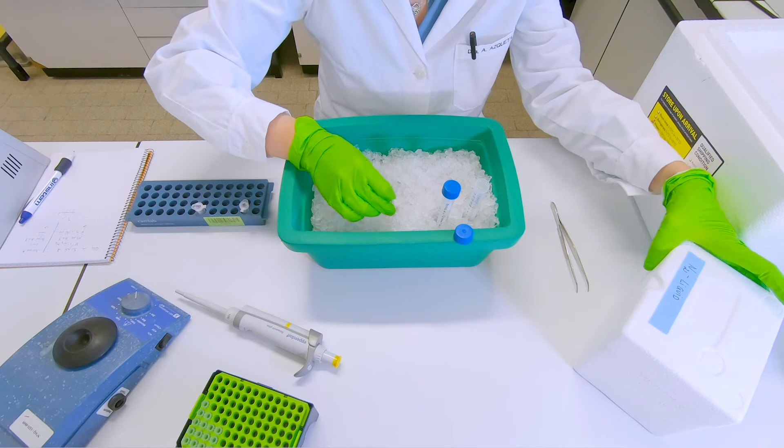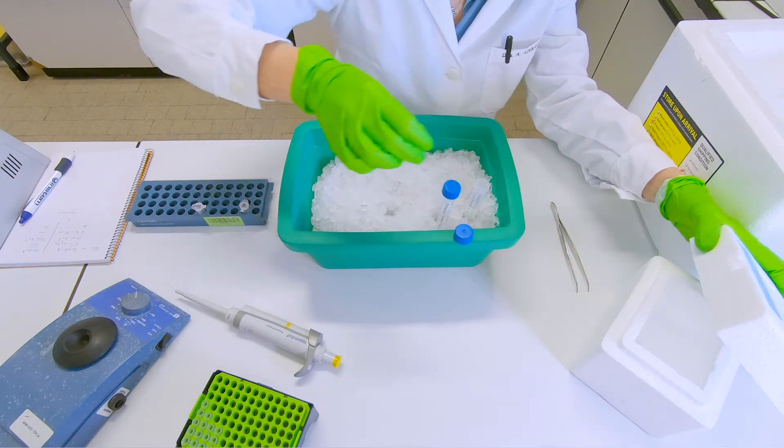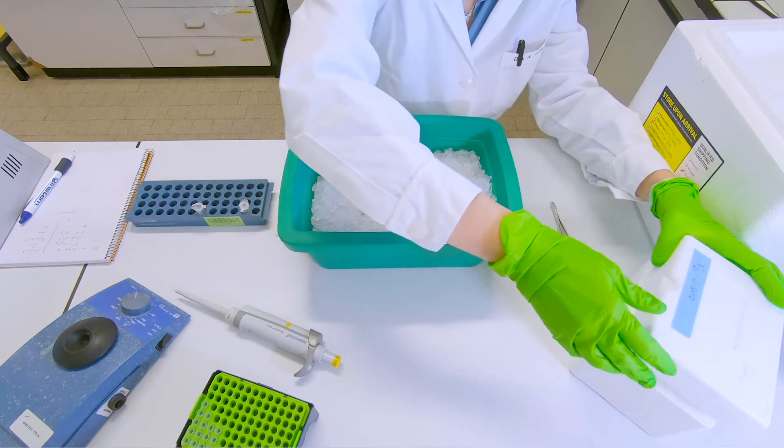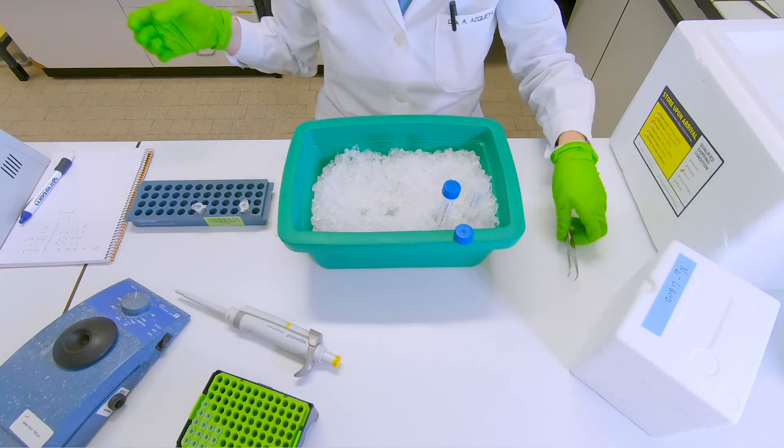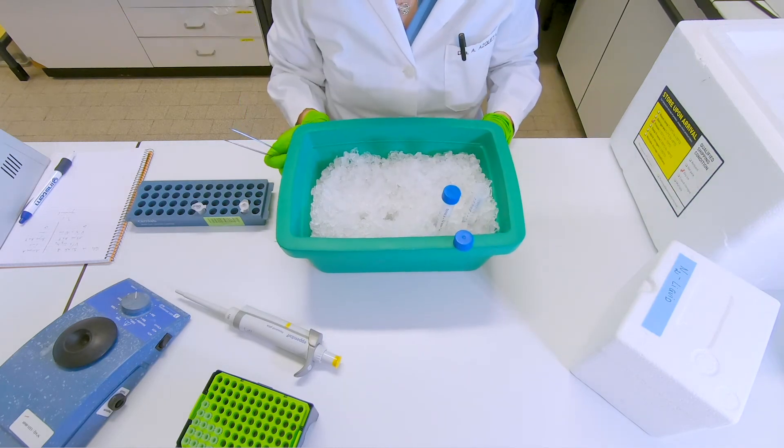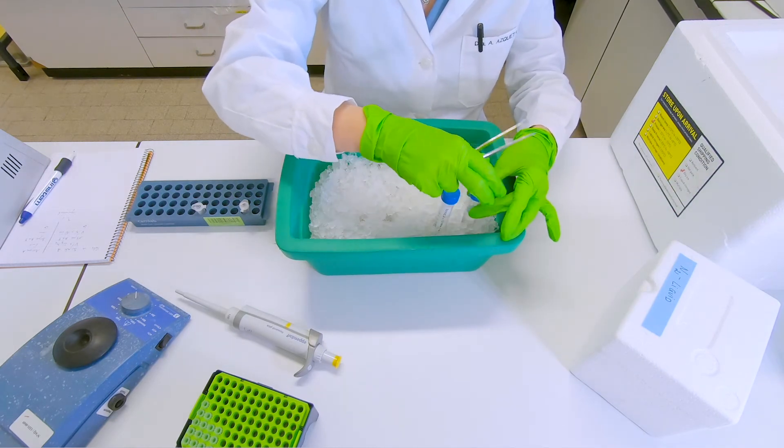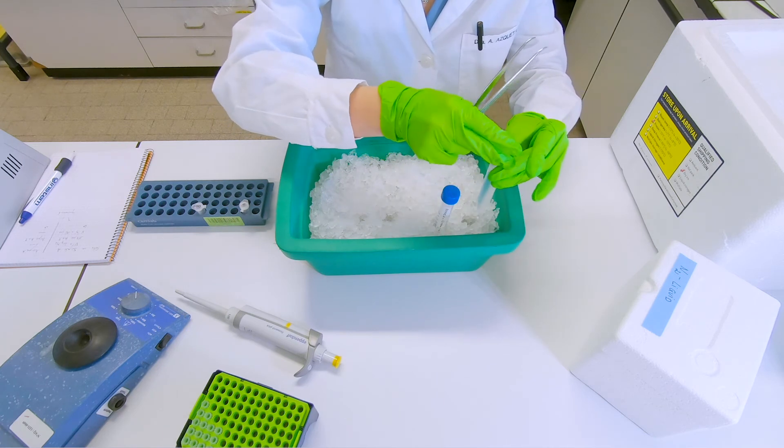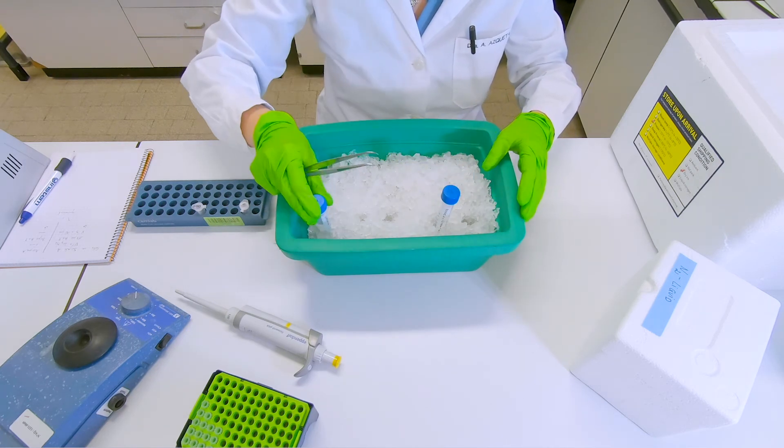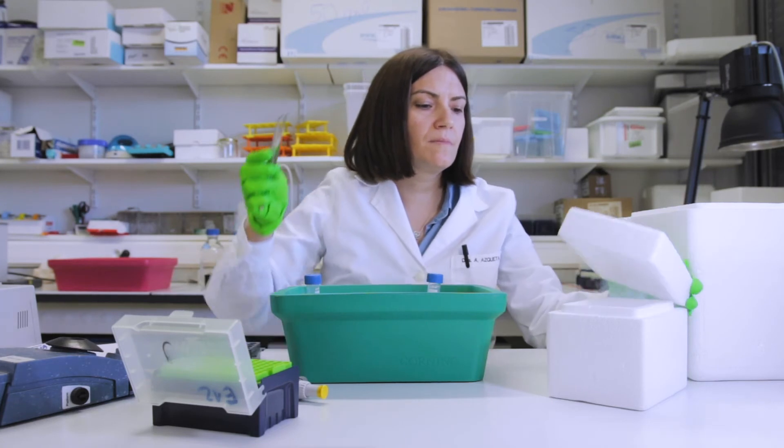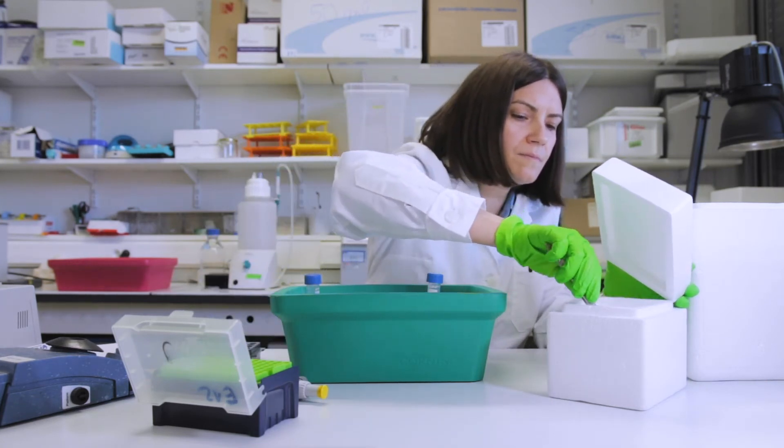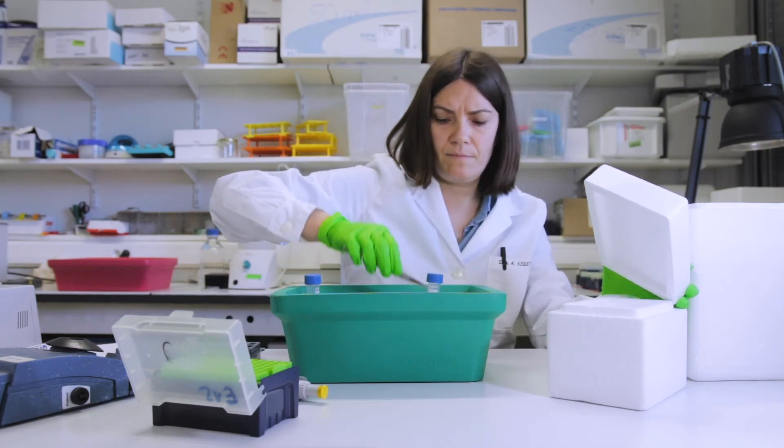And then we will snap freeze them by dropping them in liquid nitrogen. We leave them until it stops bubbling. And this is done to actually, the snap freezing will help break the cells because of the crystal formation. So when it stops bubbling, you take out the tubes and let them defrost.